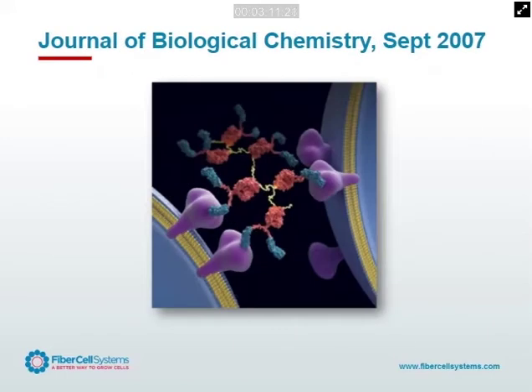So in this particular case, this is an image of the protein in question, and I'm always amazed to look at this for several reasons. First off, this is not a computerized drawing. This is an actual cryo-electron tomograph. We can see 1, 2, 3, 4, 5, 6 IgG1 subunits held together with 3 IgA tails.